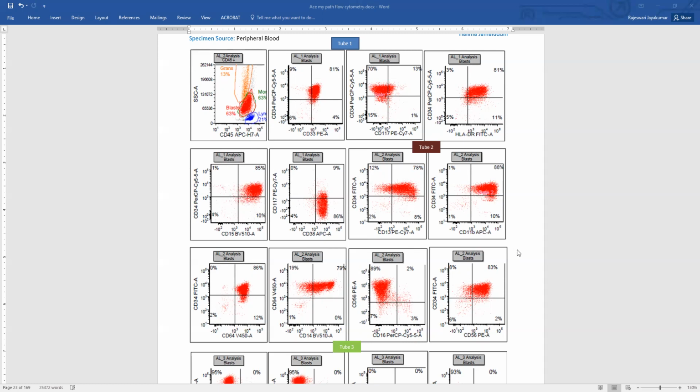So we have a monoblast population here, and monoblasts can be positive for CD13, and they usually express bright CD33. We have homogeneous CD33 positivity here, but usually it can be a little brighter. HLA-DR and CD33 usually are the brightest in the mature monocytes or monocyte lineage cells. So whenever you have a monoblast population, usually you will see HLA-DR, CD33, and CD64 positivity, and the others can be somewhat variable in intensity and positivity.